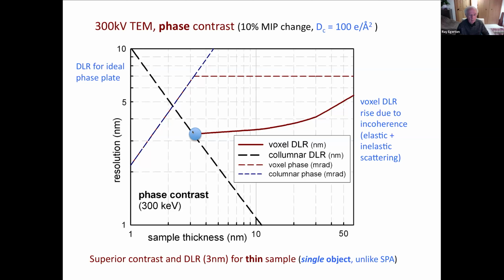And then if we had, let's say, a boundary in the polymer or a cell wall that is perpendicular to the sample surface, parallel to the electron beam, we could in principle get higher resolution by using a thicker sample. But if we have a small equiaxed particle, a small organelle, then the resolution is going to gradually get worse as we increase the thickness.